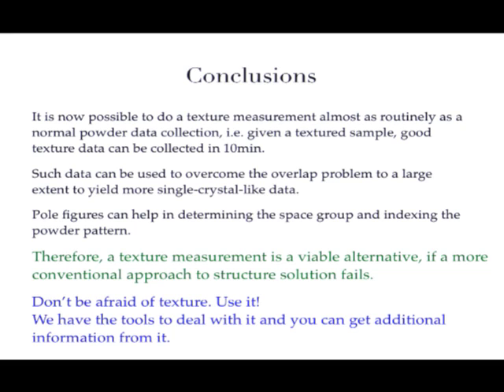Yeah, well, yes, that's true. I just showed it, that's what you can see. But it's your volume that you actually then measure if you do the correction measurement to do the correction. You measure it, you don't calculate it, we measure it because the volume depends then on the absorption coefficient.